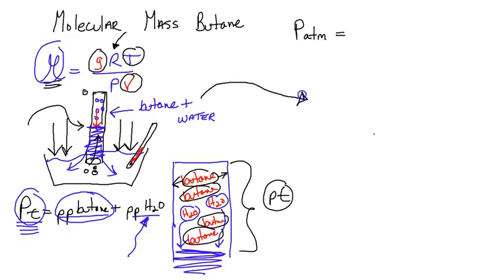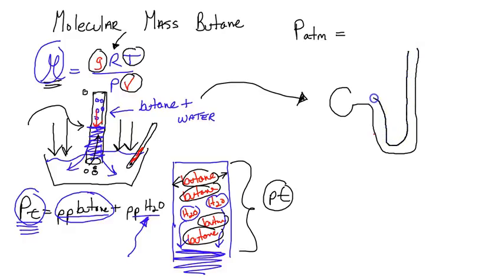Let's make one of those diagrams maybe you've seen before. So I'm going to put the gas in a container, and we'll go down. This always reminds me of a nephron in a kidney, but hey, here we go. That was the ugliest manometer I've ever drawn. Okay, let me try that one more time. So here we go, down and up. Okay, that'll be an open tube. All right, and I'm trying my best here. All right, it's better. Okay, so this will be open to the atmosphere.